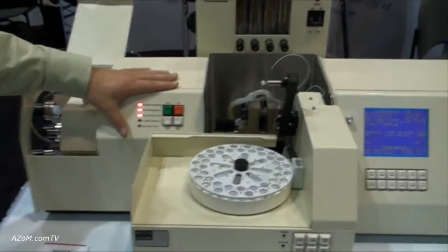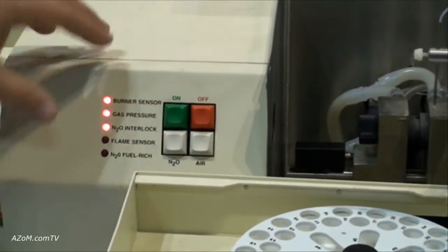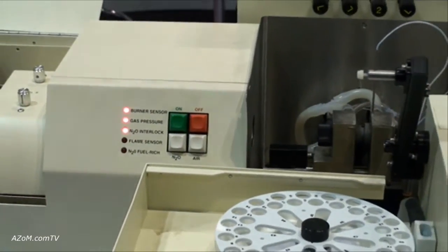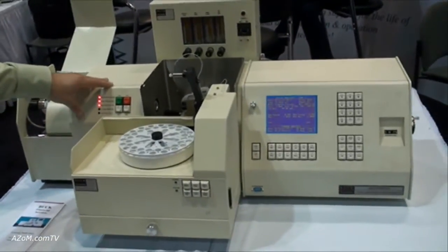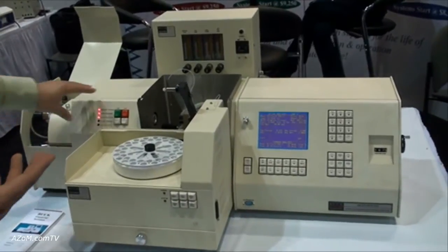The 211 has auto flame, so if you have the flame burner head installed you can automatically light the flame, which makes the system a little safer to work with for students. It also has a safety interlock for the nitrous oxide head and automatic conversion to reduce the risk of flashback.